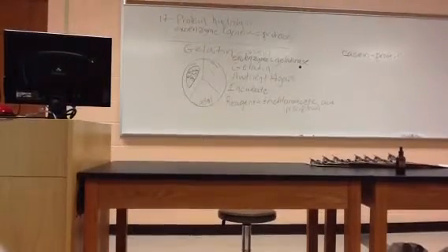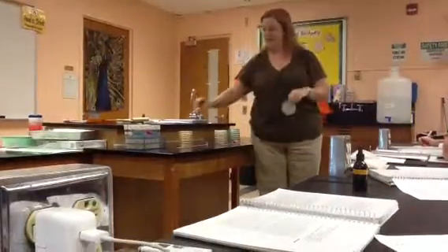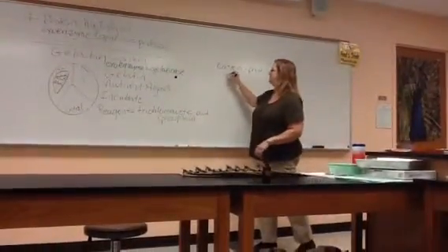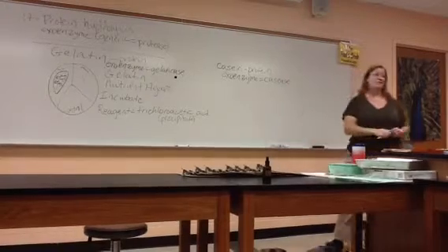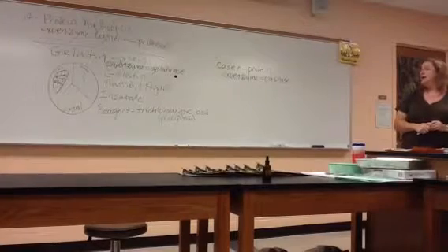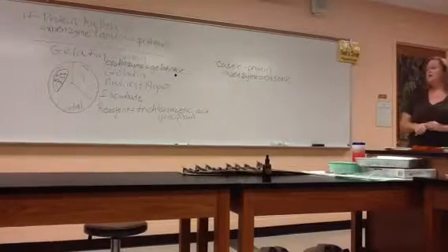So it already is white. So you can actually kind of see the difference. If I hold up the gelatin plate and the casein plate, the whiter one has the milk in it. So it's the casein that makes it white. So that's the protein we're going to give them. And what we're testing for is to see if they make the exoenzyme for breaking it down, which is called casease. So that's the exoenzyme that destroys casein. But again, not every bacteria can produce it, right? That's what we're trying to find out. Do they make casease or do they not?